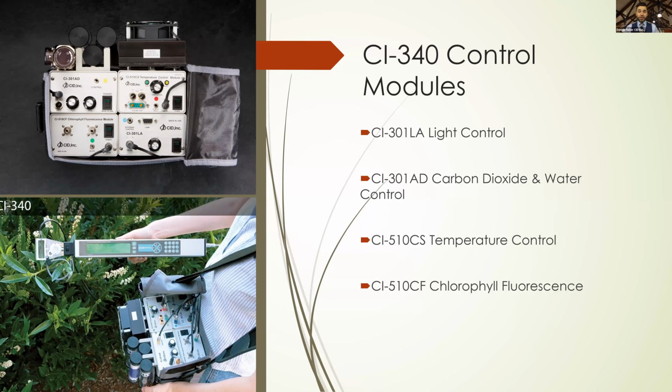Now, again, these are all optional modules. You could use 1, 2, or all 4 at the same time. And they are frequently not even necessary for most of the studies that are utilized, but they are very useful if you would like to see how your study reacts under different conditions.